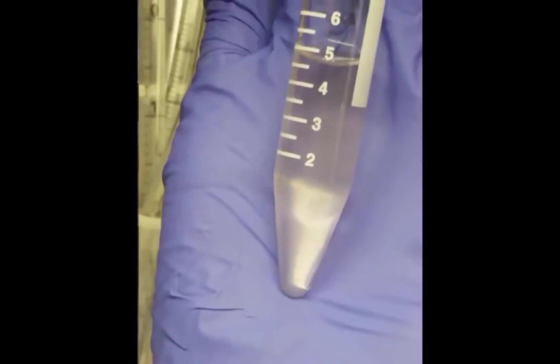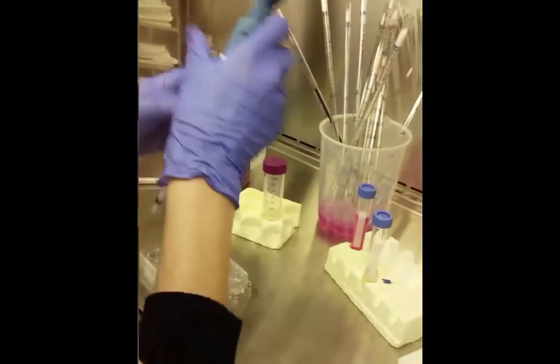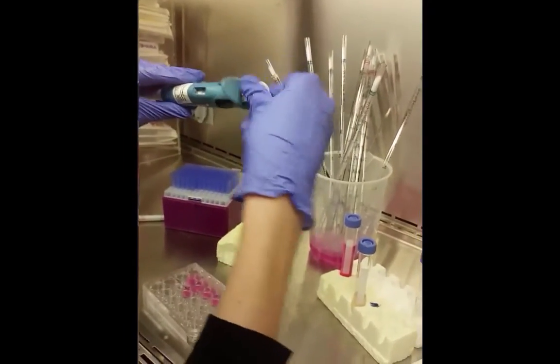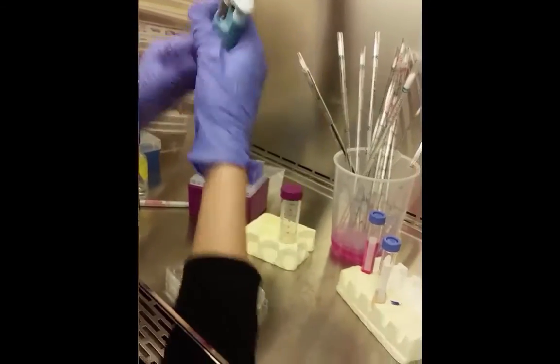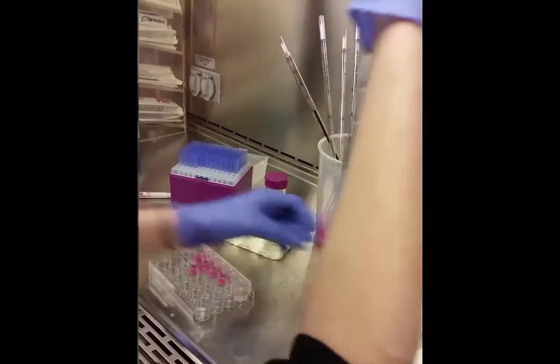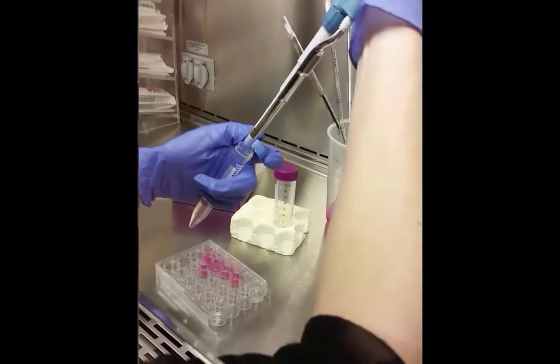And now you're ready to seed that alginate solution into the well plate. And in this experiment, you're going to make approximately 10 samples. And each of those samples consists of 300 microliters of alginate solution pipetted into the bottom of a well. So you'll use a micropipette for that.